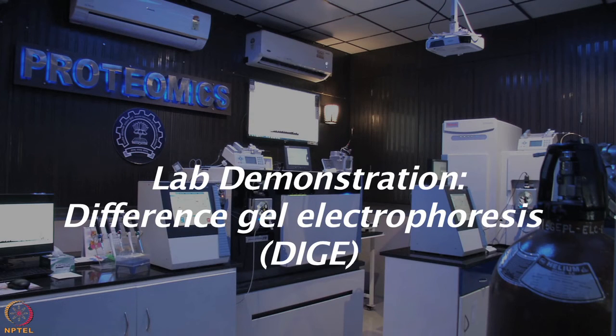In the last lab demonstration session, you have seen how 2D electrophoresis can be performed. Let us now see some of the minor changes which happen while performing difference gel electrophoresis. So, let us start the laboratory demonstration session for DIGE, where we will only show you the key steps which are different in performing DIGE as compared to the 2D workflow, and the rest of the workflow remains similar for 2D DIGE based experiments.